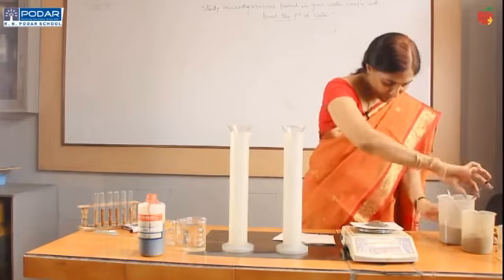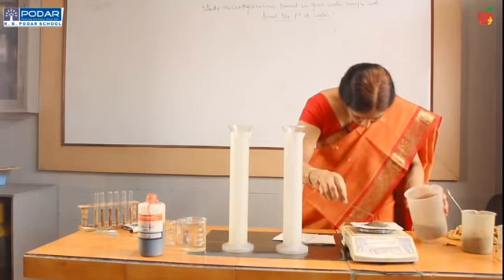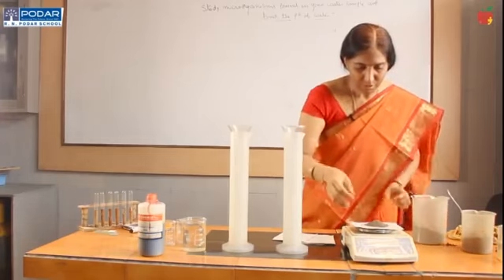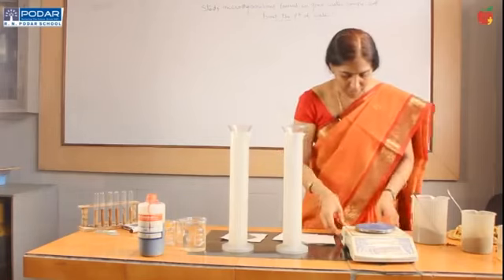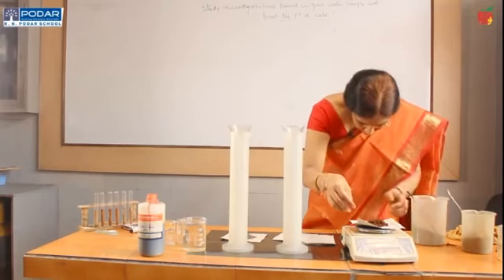I am taking 25 grams of roadside soil with the help of a spoon. I am keeping the 25 grams of roadside soil aside. Then I am taking 25 grams of garden soil also, approximately.